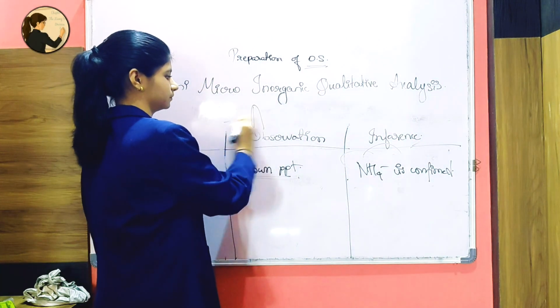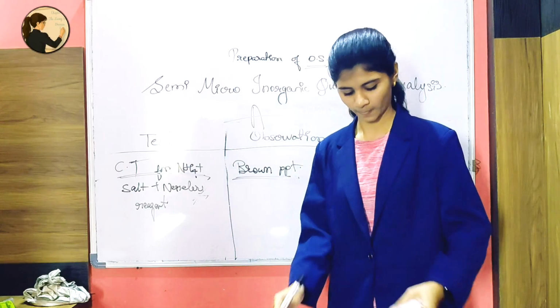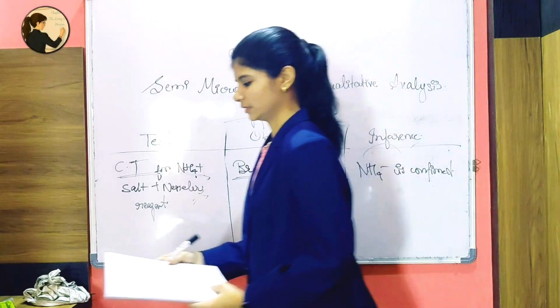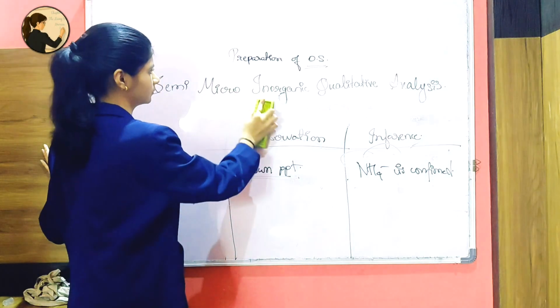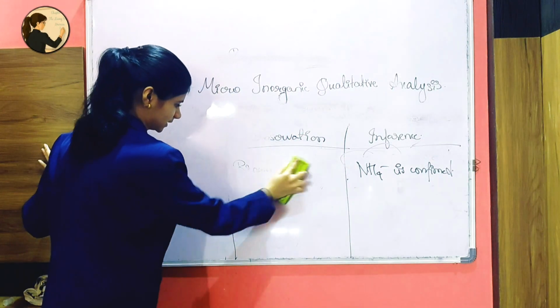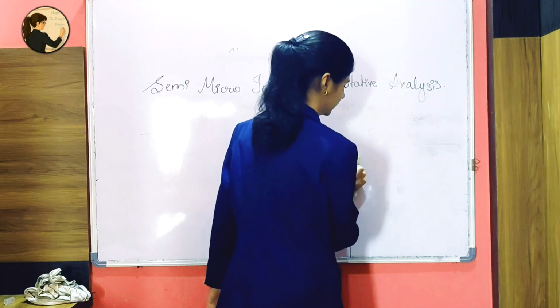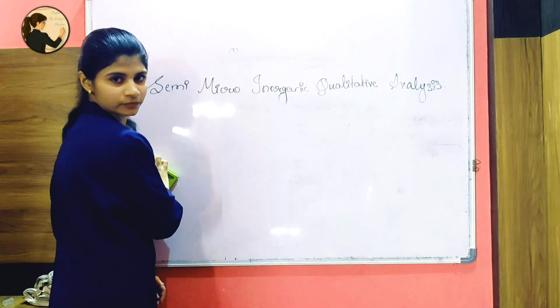Analysis of group 0, I'll tell you if it is there or not in the WhatsApp group. So now there is confirmation of NH4 plus. This step is very important. After doing detection of the basic radical, next is the result. You have to be really very careful while writing that, because you are learning chemistry from class 7th itself, right?